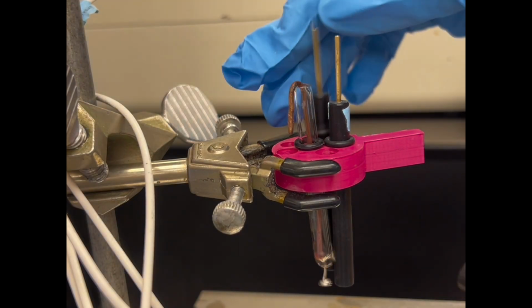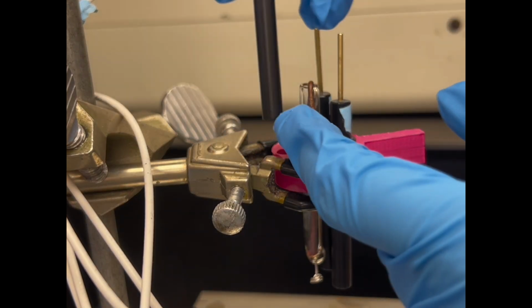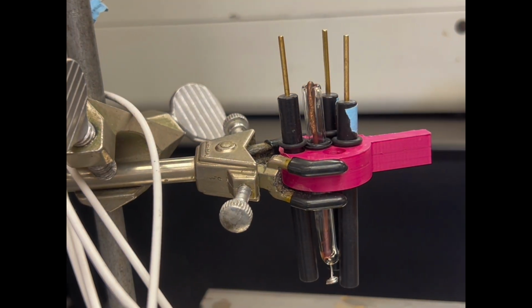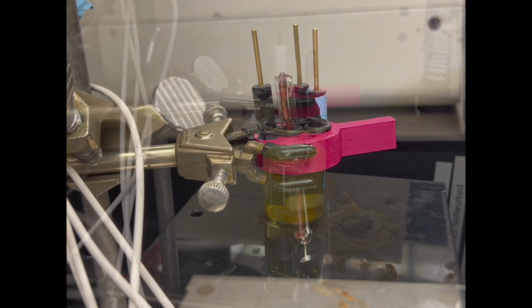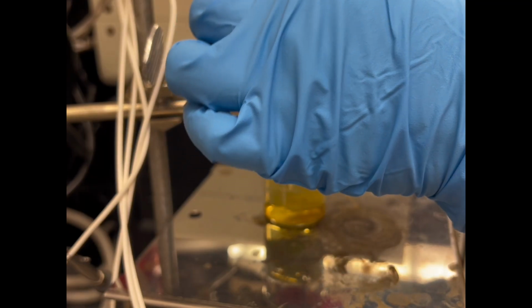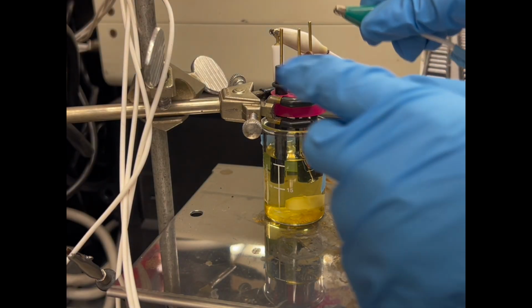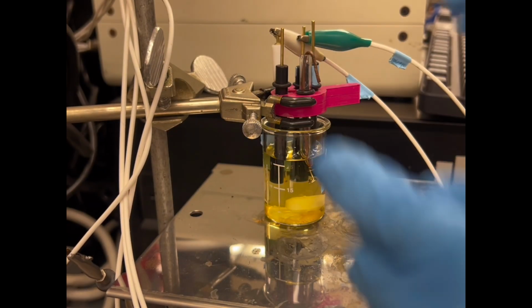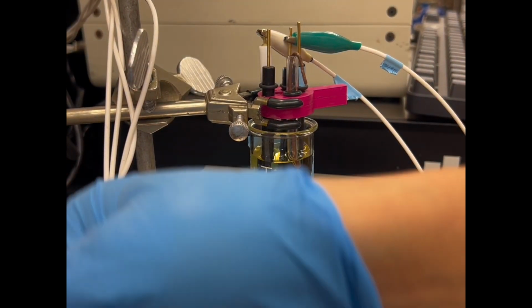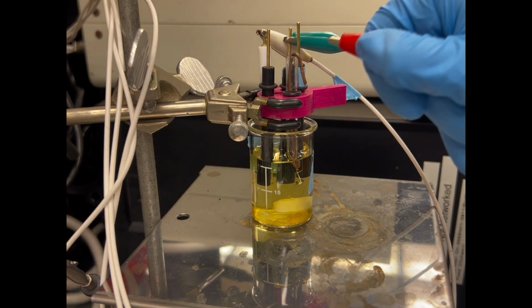After we set up for the electrochemical measurement, we should take a 25 ml volumetric flask to measure the phosphate buffer solution. Please use a volumetric flask to measure, because we want exactly 25 ml in order to control the PFAS we added. So we have the concentration of solution that we designed before.